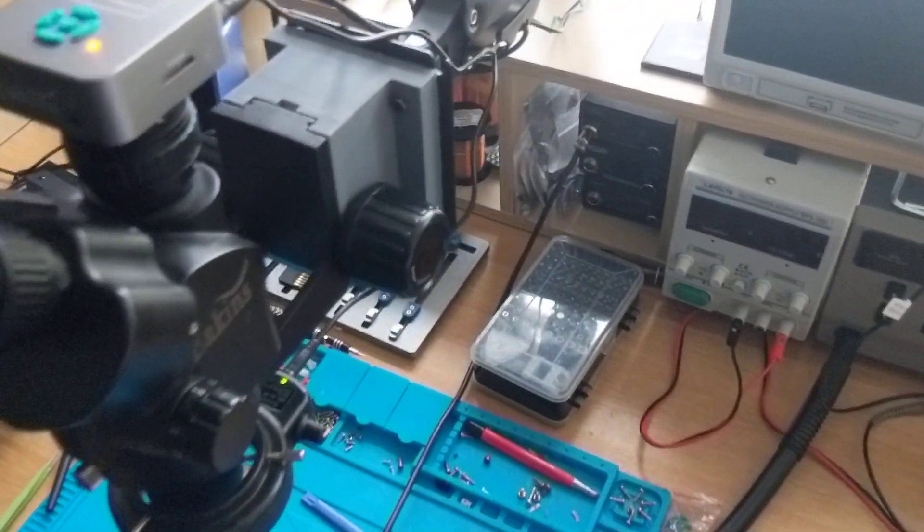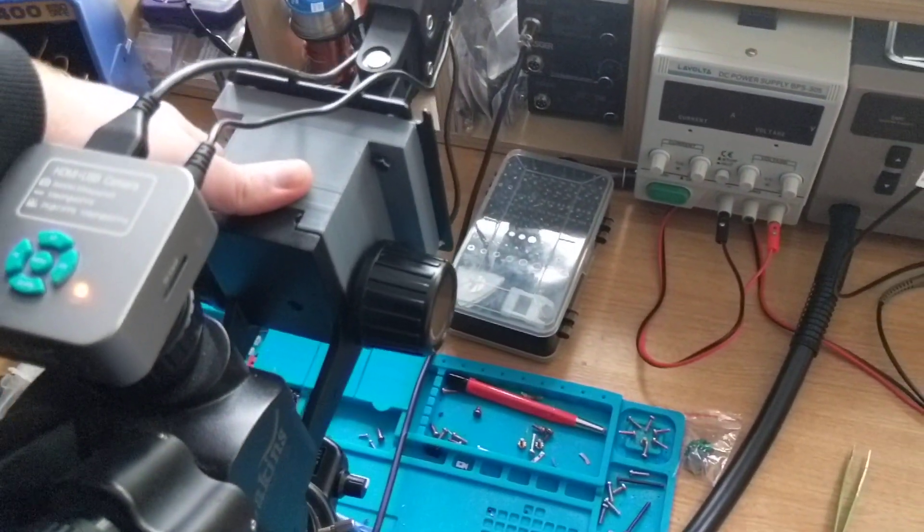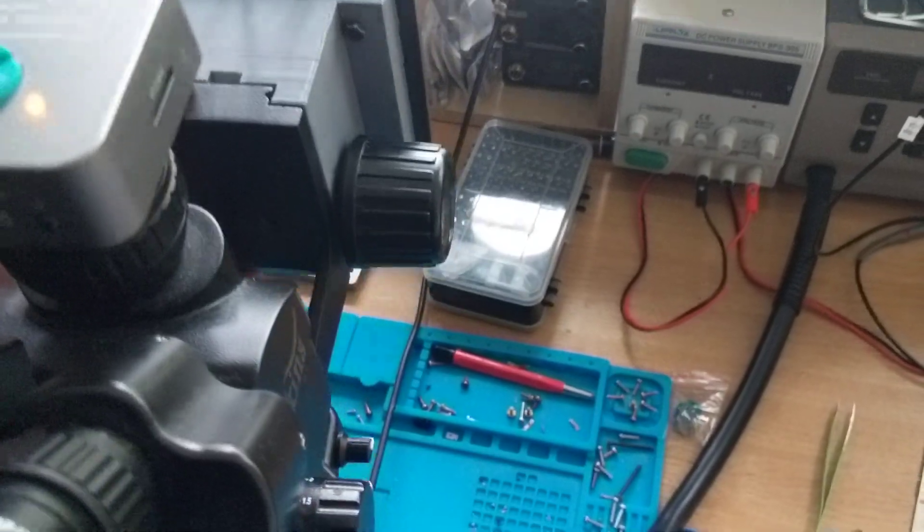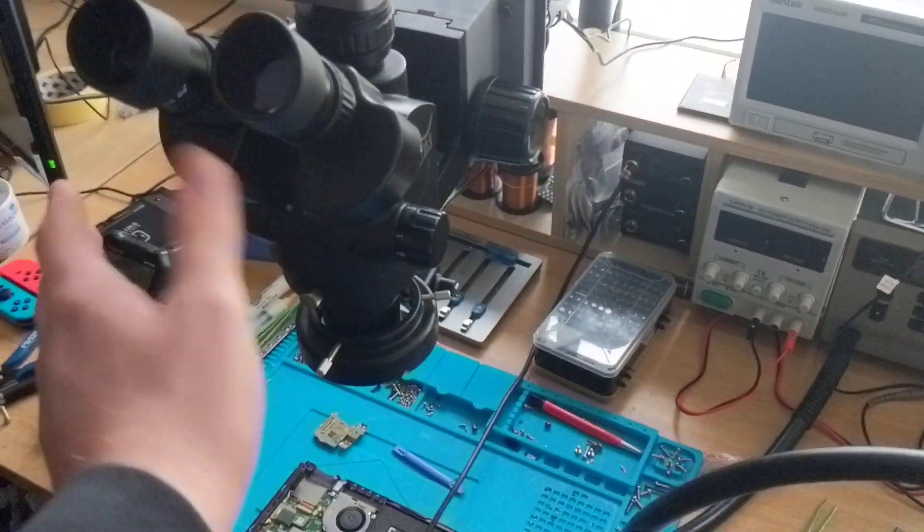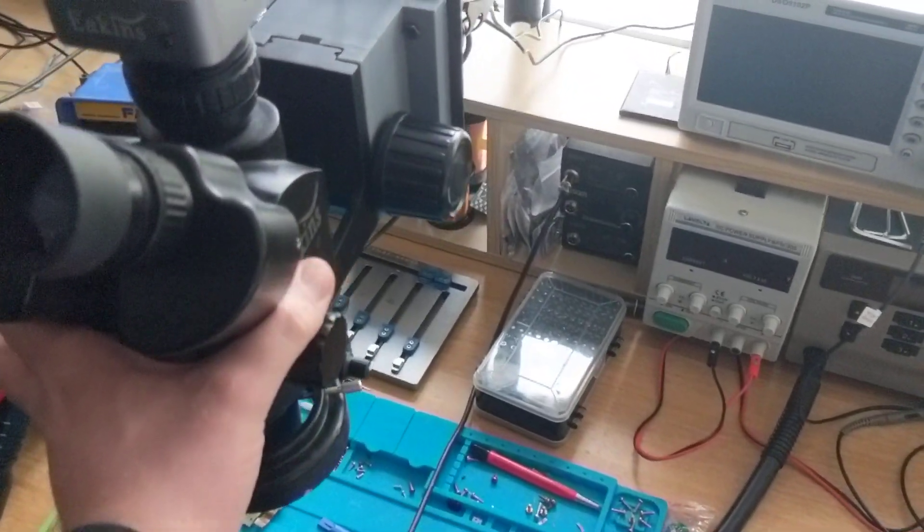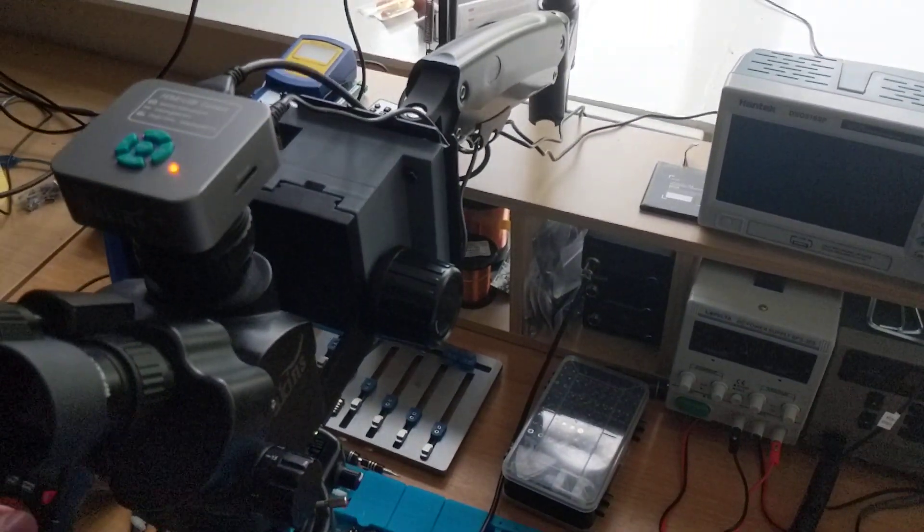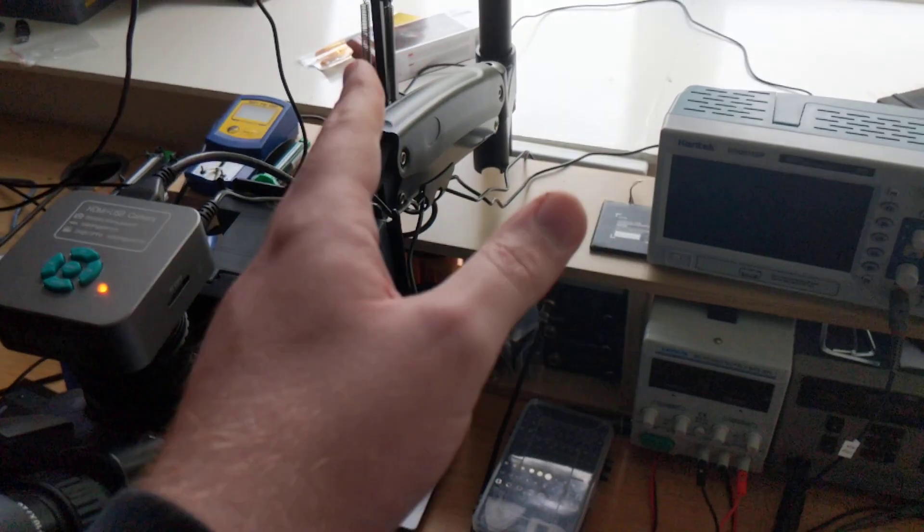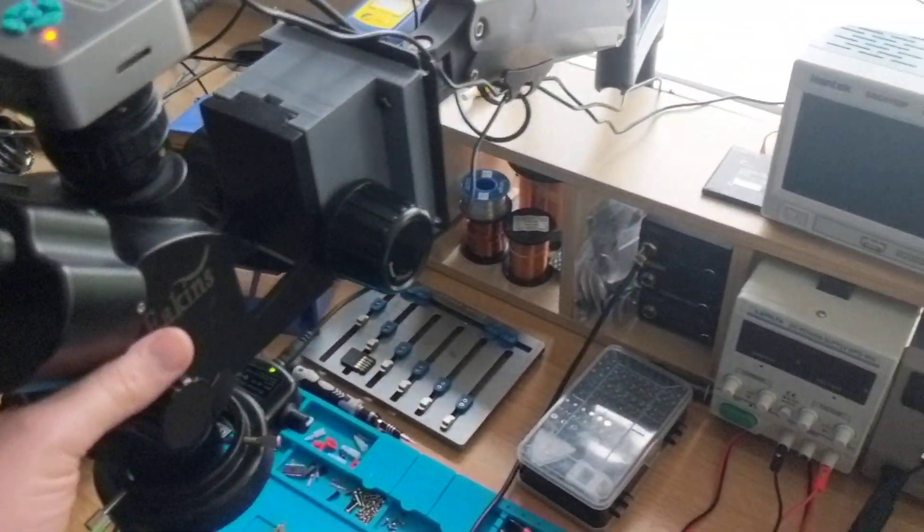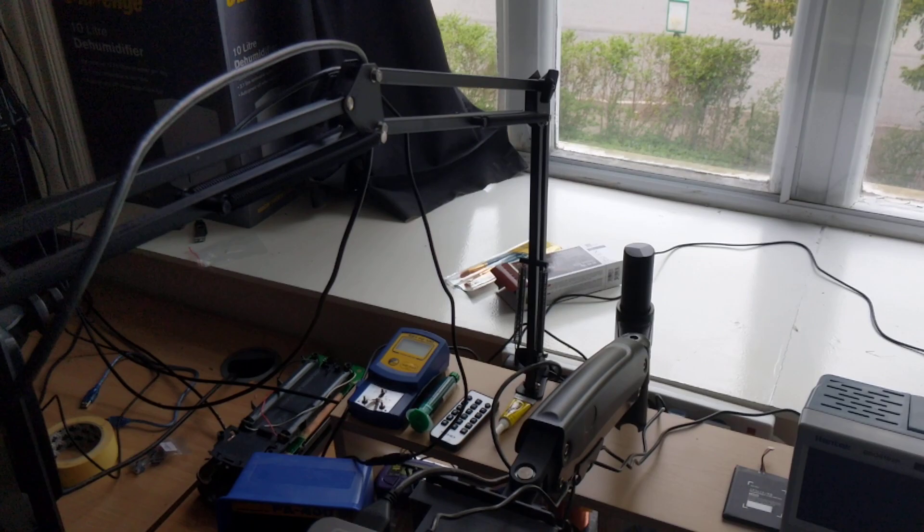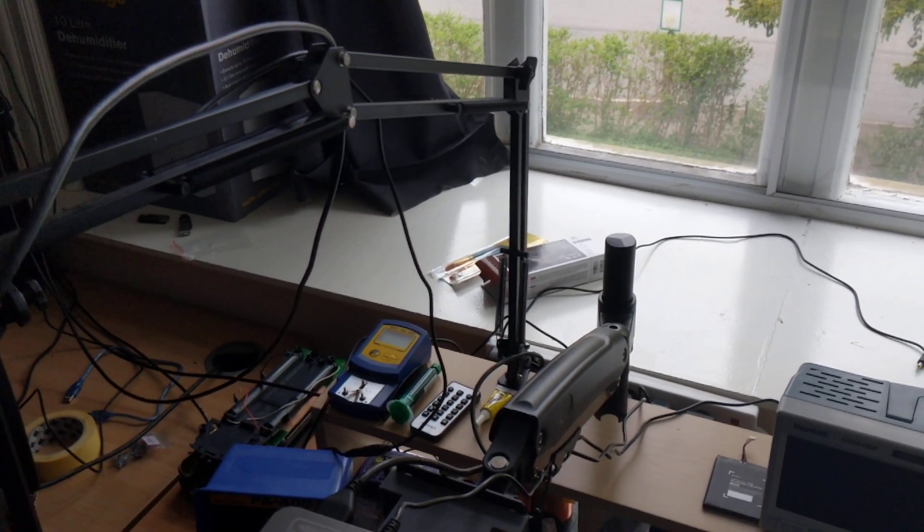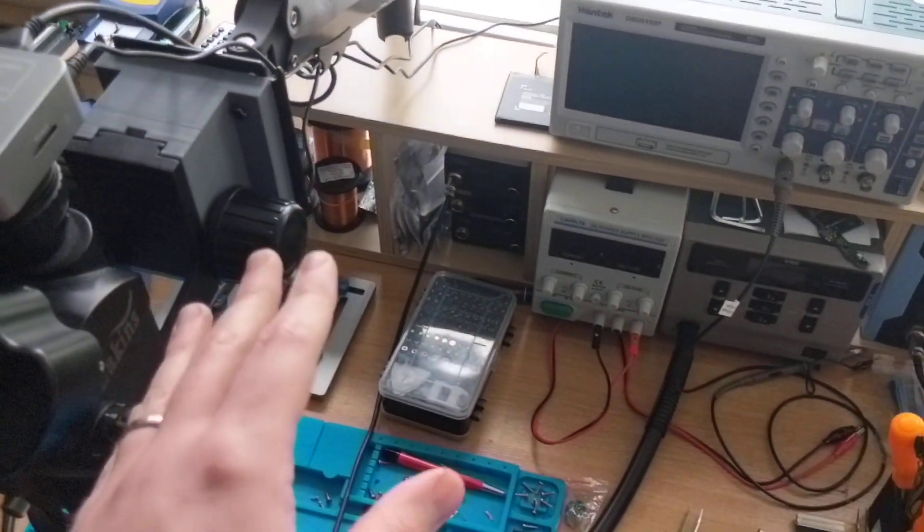I really think this is a pretty good solution. We can see it moves up and down just fine. The microscope holds its position, it doesn't slop around or anything like that. Mine wobbles a bit as you can see but that's not down to the arm, that's down to my desk being a bit wobbly.